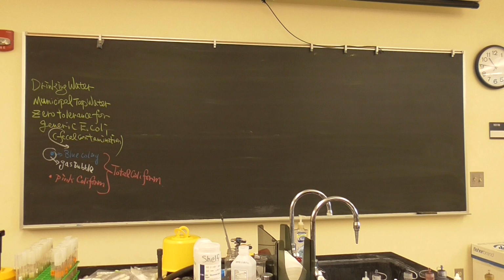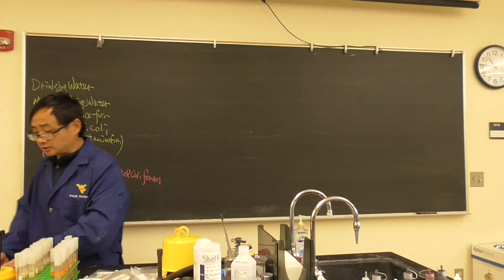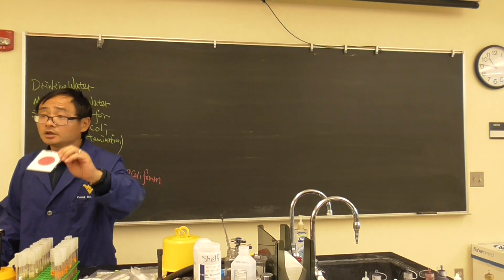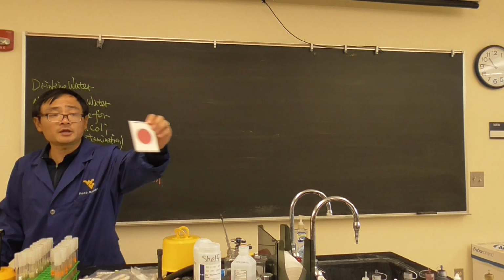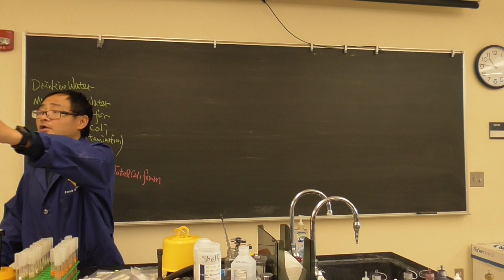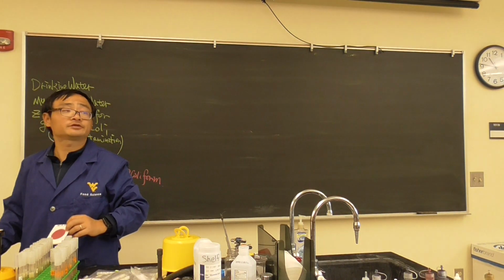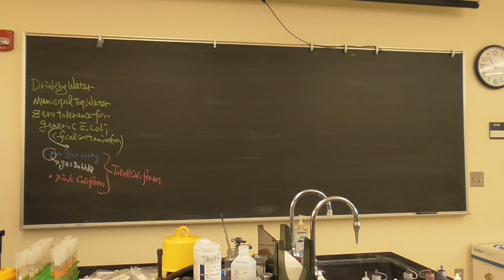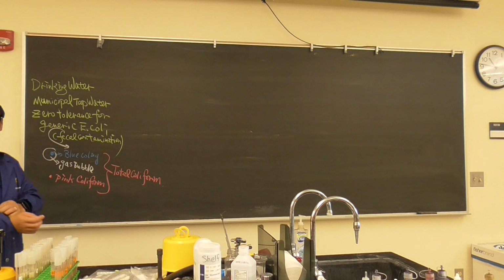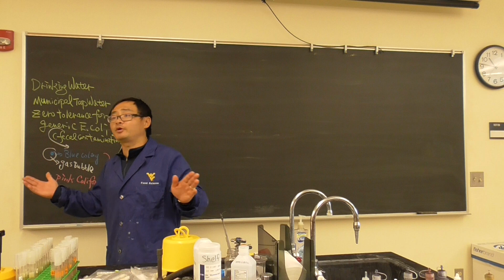Does anybody else find the generic E. coli? Which means on your petrofilm, the pink one, you see there is a blue colony there. Now, for example, this student doesn't have anything. It's just coliform, it's not E. coli. Does anybody else have it? Okay, that's good. We at least have one sample in the whole classroom which looks really nice. Okay, very good.